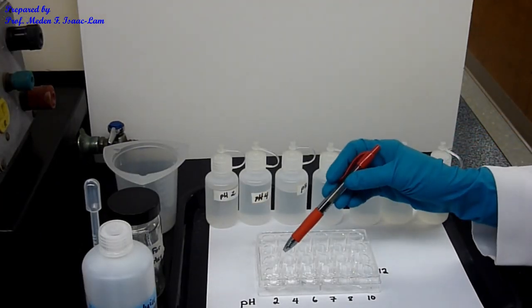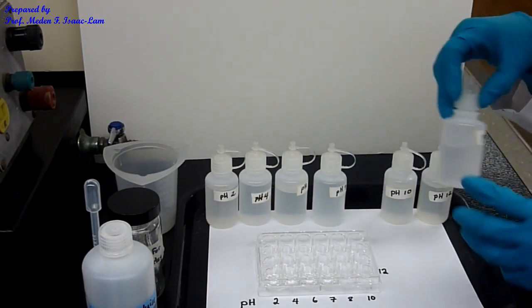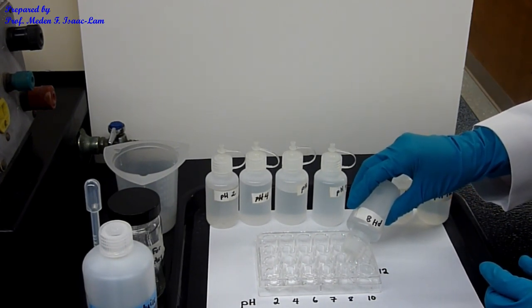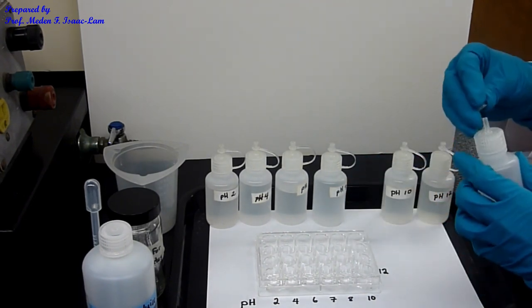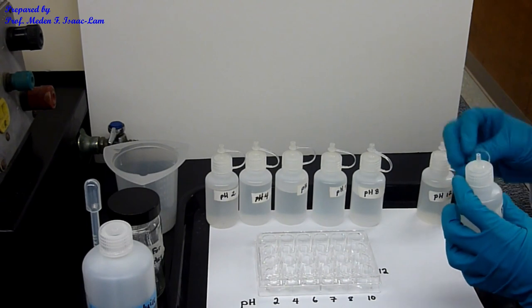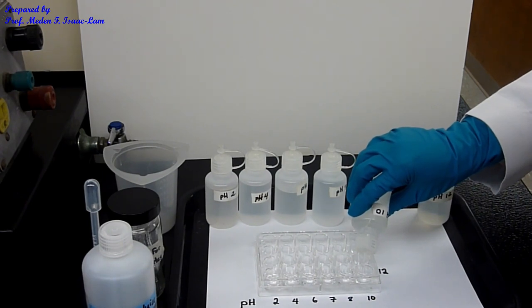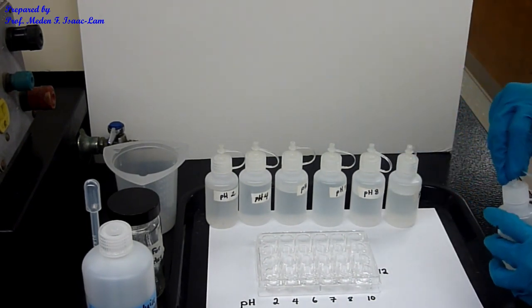I already put about 20 drops of the solutions for pH 2, 4, 6, and 7. This container actually serves as a dropper, and I'm just going to put in pH 8. This container is very convenient. You don't need a dropper for it. I have two more samples to put in. This is pH 10. And one more, pH 12, I put it in this well.